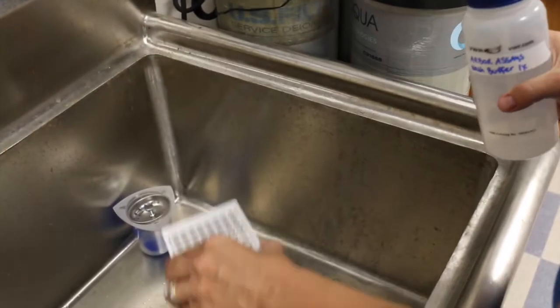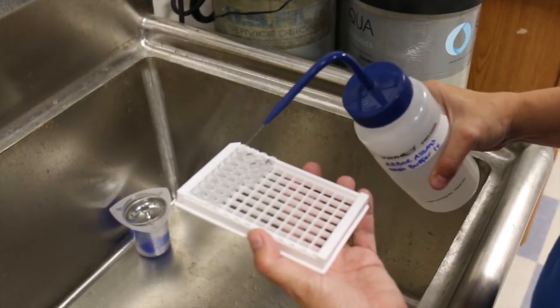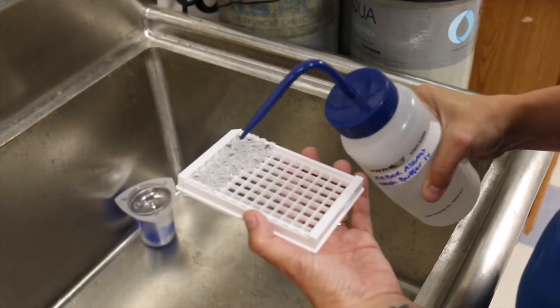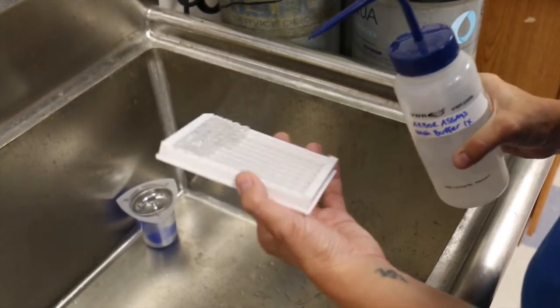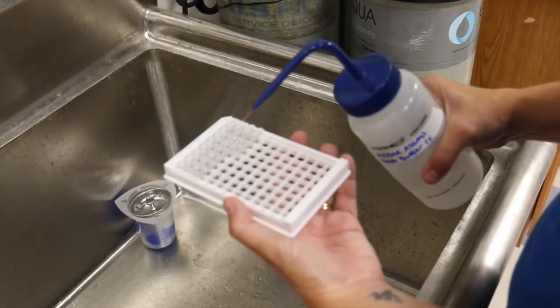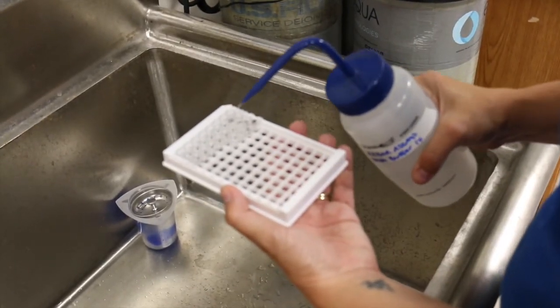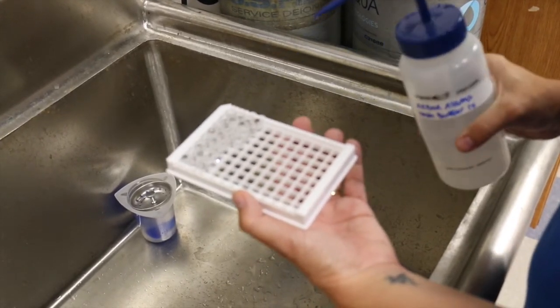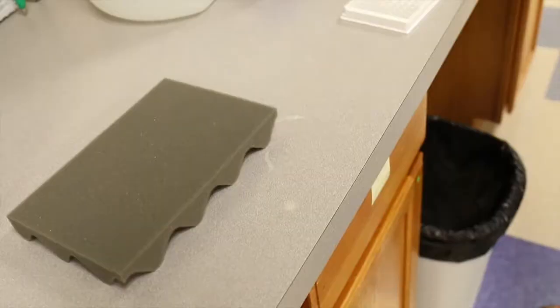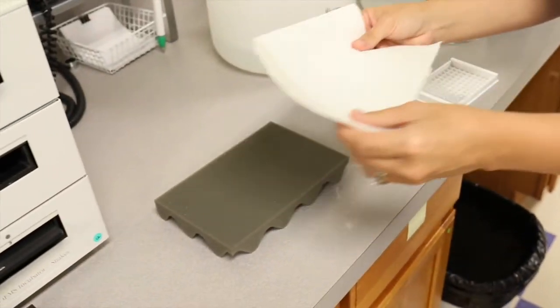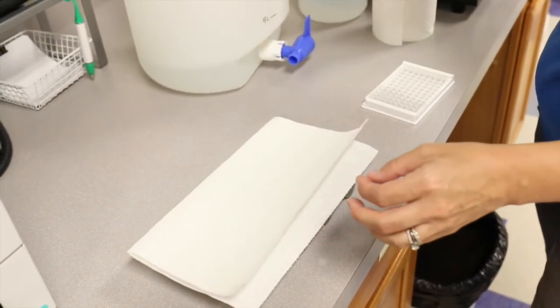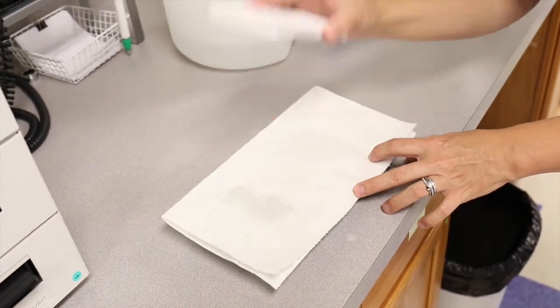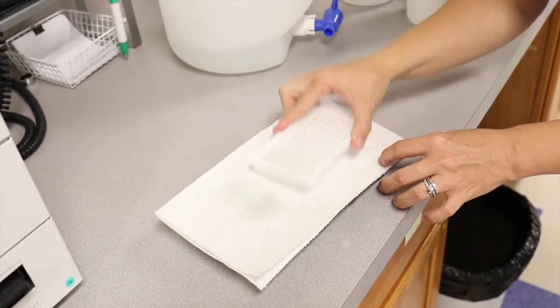If you cannot find a plate washer close by, we suggest that at the end of the incubation time you dump the contents of the wells down the drain. Fill each well with the kit specific wash buffer from a wash bottle. Dump the contents into the sink and repeat four times. Whichever plate washing technique you use, tap the plate on clean paper towels to ensure that there is no residual wash buffer left in the wells.